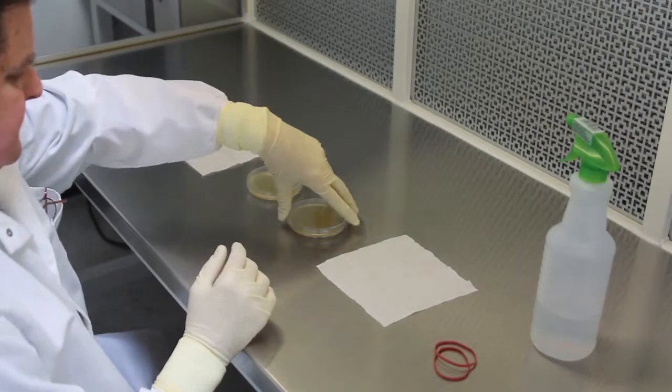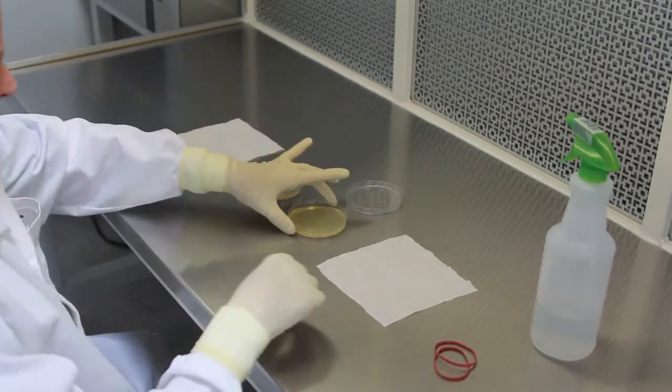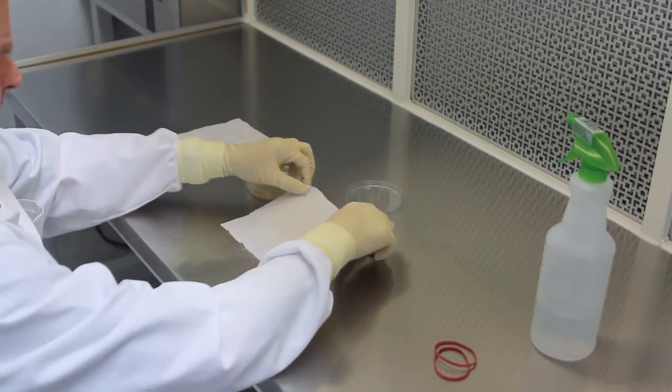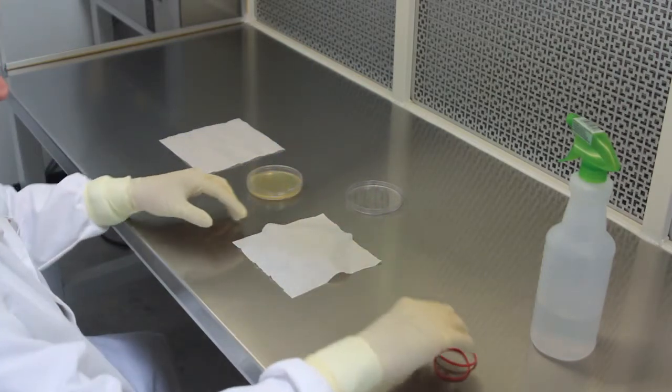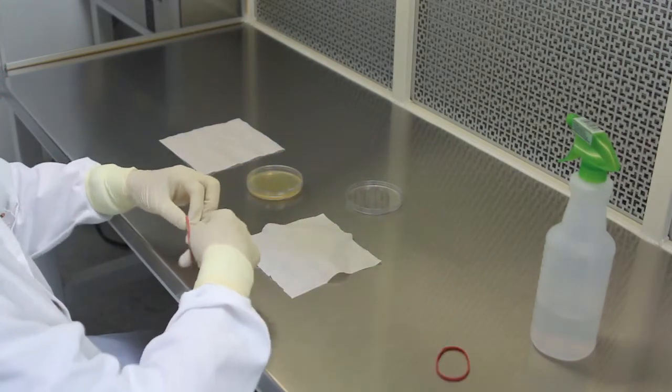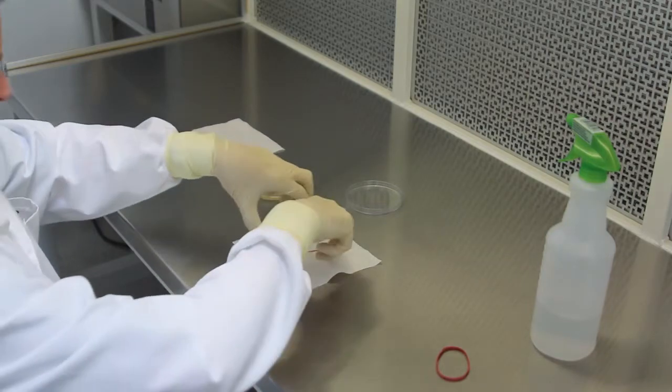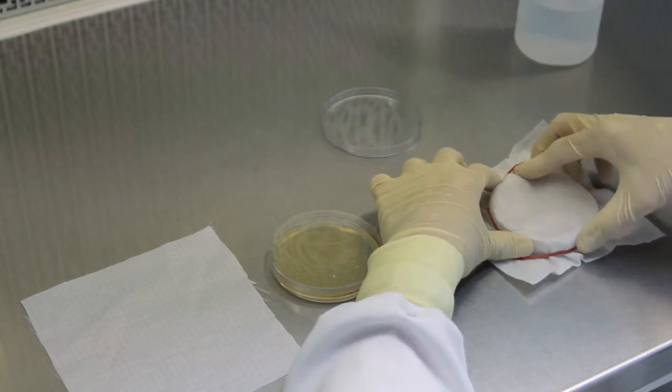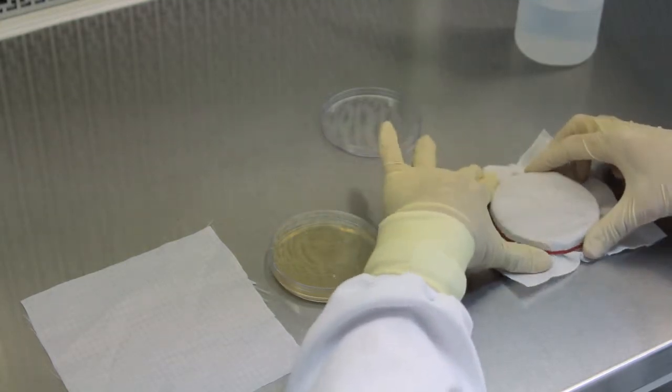Let's look at the test method that produced these results. This is the reenactment of the test performed by a manufacturer of disposable cleanroom garments and posted on their website. It is Prudential's contention that, if the test was performed as shown, both the disposable and reusable garment fabrics would have very high BFEs.